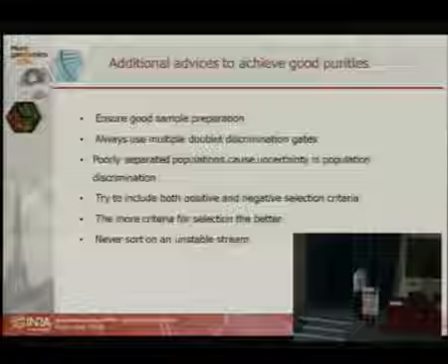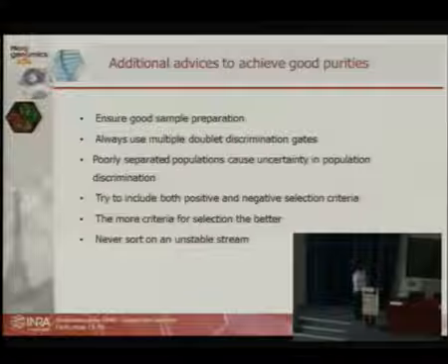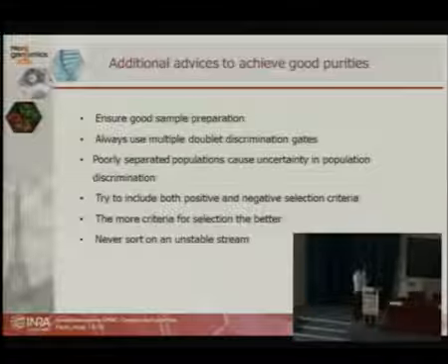And I think I am short on time, so any additional advice? Good sample preparation. Always use multiple doublet discrimination to really make sure you don't look at artifacts.